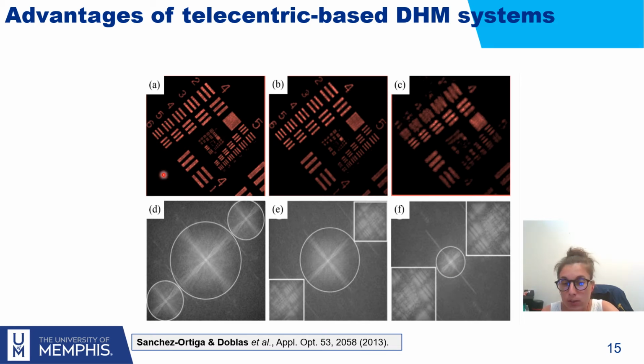This is a USAF target, and as you know, the target allows you to discriminate the minimum resolvable element. It's a way to know the resolution of your system. For example, here the minimum one is the 5-6 element. Now if I go to the second column, I think it's the 5-3. This is the last element that I can see with my eye.